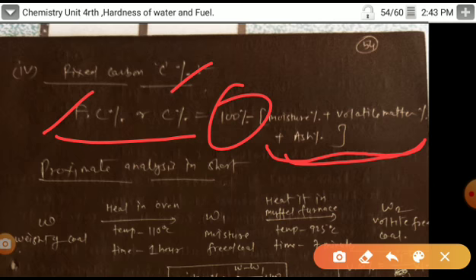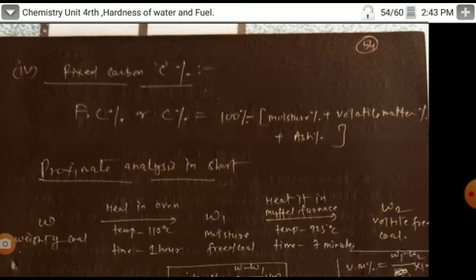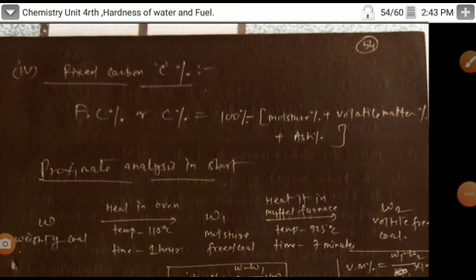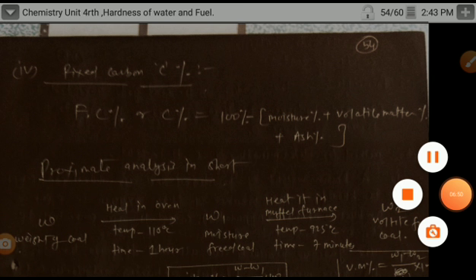So this is the proximate analysis of coal, which is an important topic in the fuel chapter. The proximate analysis always comes into the question paper, and you should prepare it accurately.